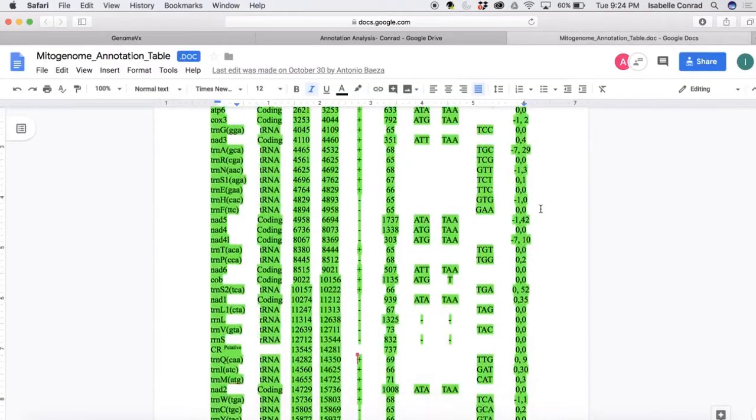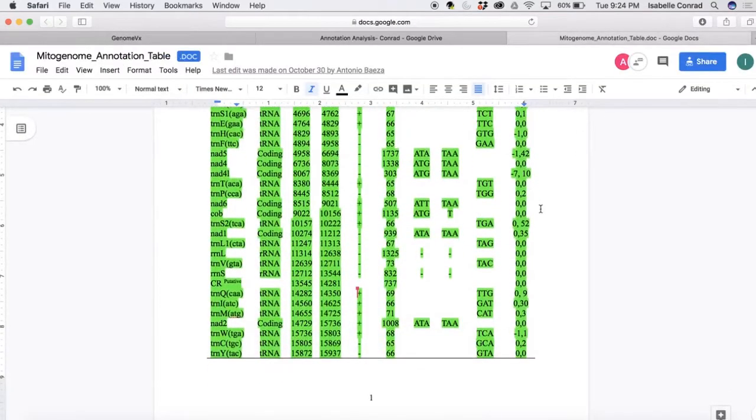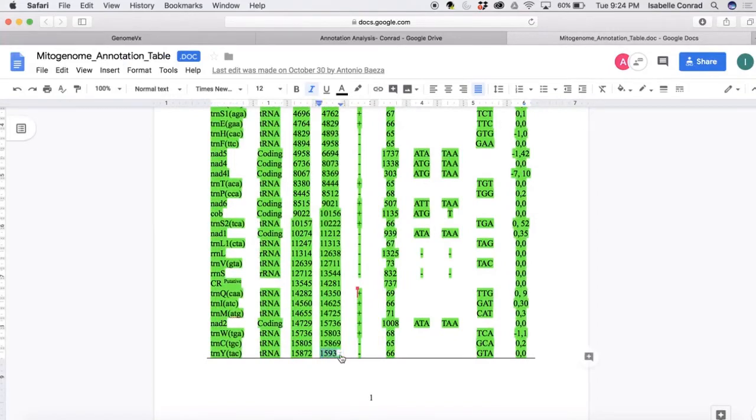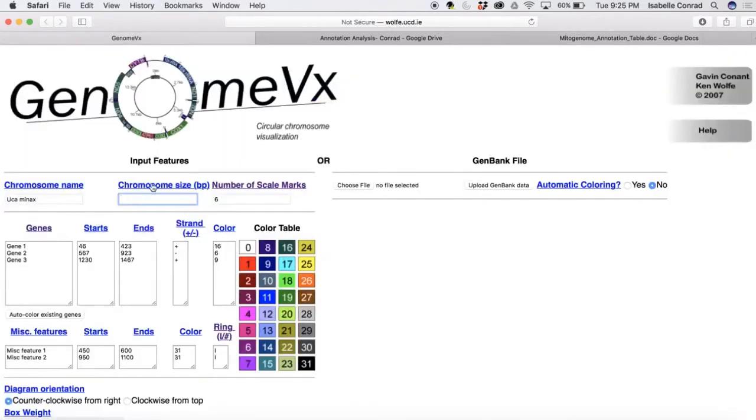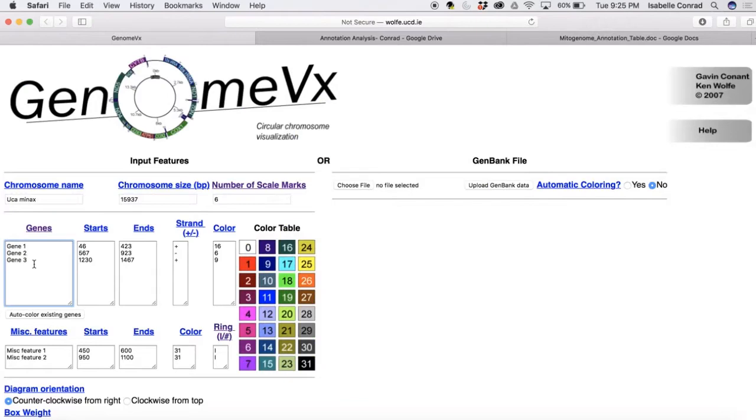Now we are going to enter in the size of the mitochondrial genome. You're just going to go to your last base pair on your annotation table, copy that, and put it in chromosome size. So that's 15,937 for this specific example.